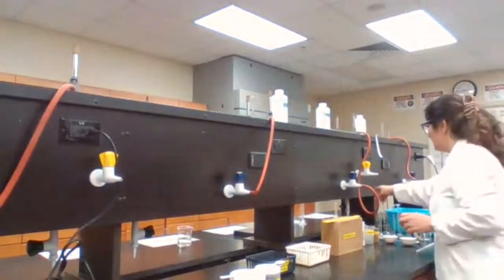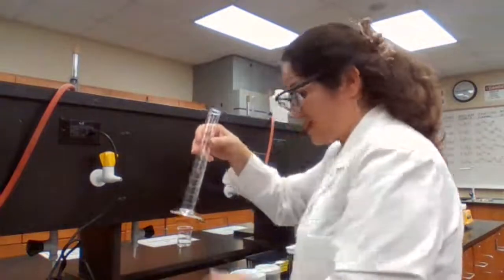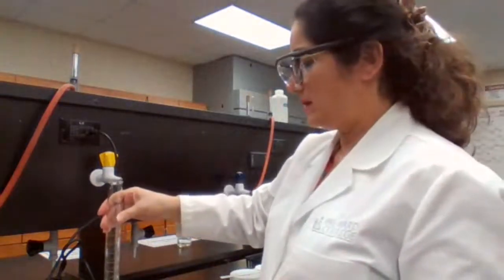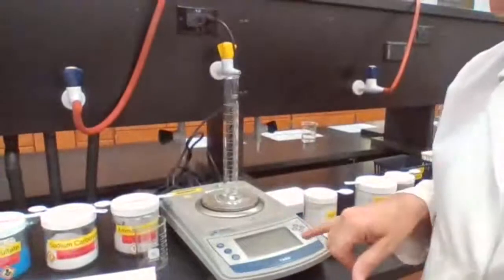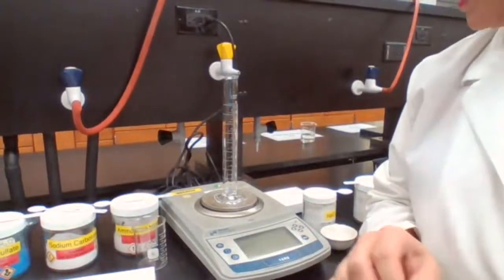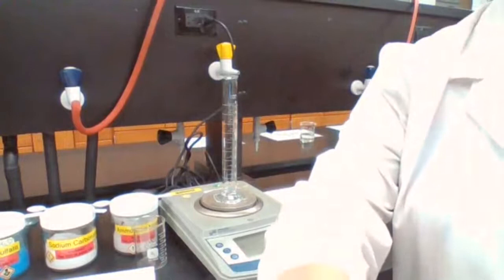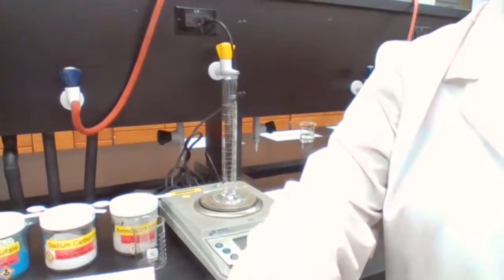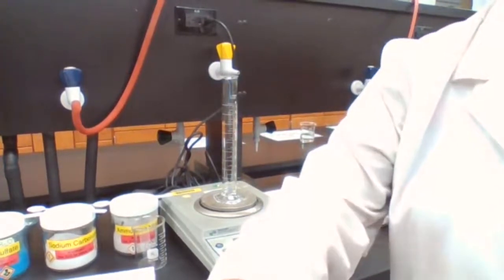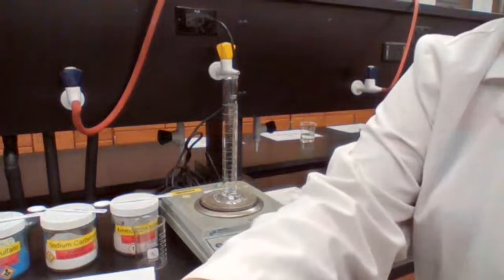Next, the mass of a 100 milliliter graduated cylinder. You probably noticed that all the objects I'm placing directly on the balance are clean and dry. They are not chemicals, so they don't damage the balance stand. The number is 119.285 grams. That is the mass of the 100 milliliter graduated cylinder.